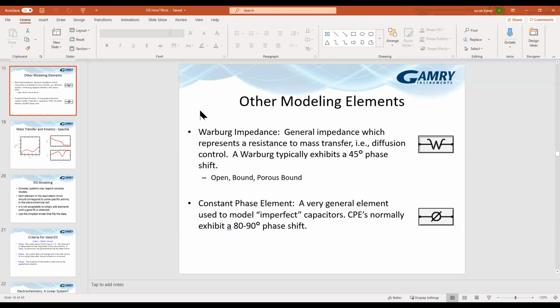For most 3 electrode systems, the blue and the green are work, sense, and working. They are shorted together, connected to the working electrode. The red lead is connected to the counter electrode. That completes the current path. And then the white lead needs to be connected to a reference electrode that is in that same solution.